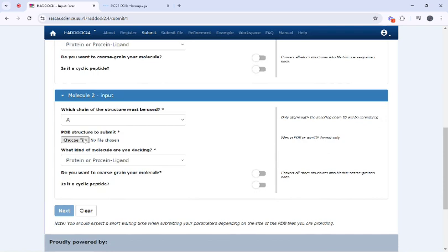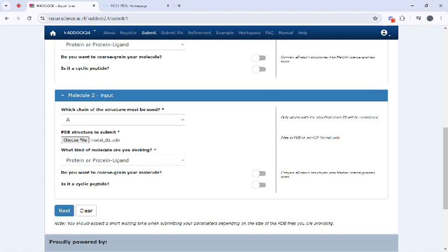Then you have to put another protein structure. Here I will add another protein structure. This one I will add and then you have to click on next.